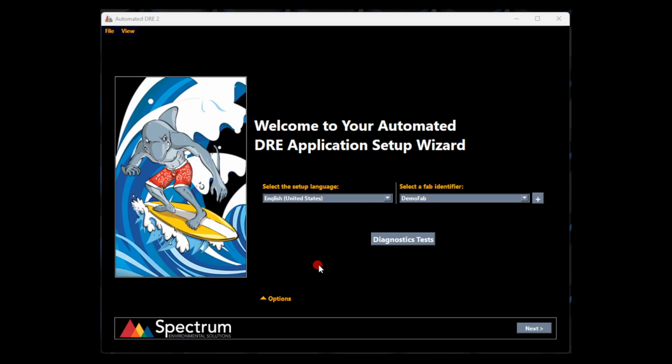the AutomatedDRE version 2 software. Part 2 will explain how to view previously collected data and make small changes to the results through the graphical user interface of the AutomatedDRE 2 program.